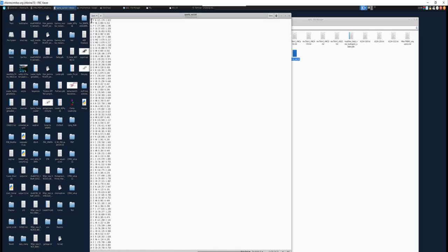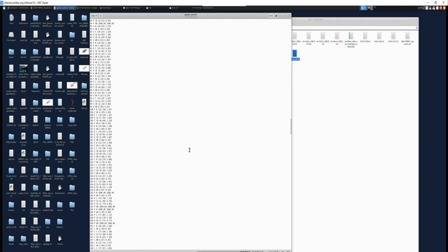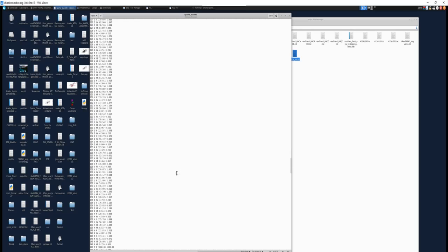First column, again, amino acid residue number, residue type, atom type, your chemical shift that's predicted, and the error. And this will be the size of your sequence, right? So if your sequence is smaller than the Sparta Plus file because you're only assigning a particular portion, all of that extra stuff will be chopped off.